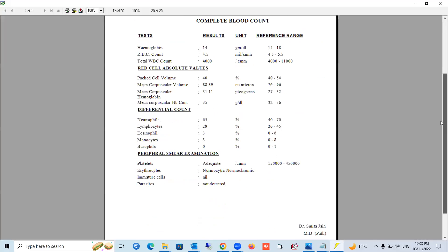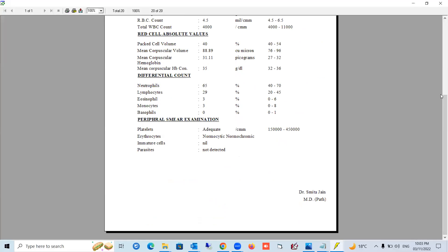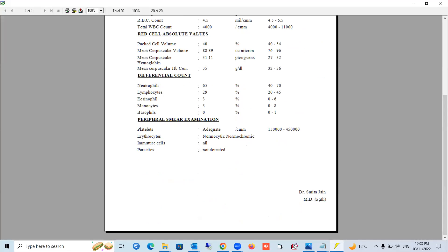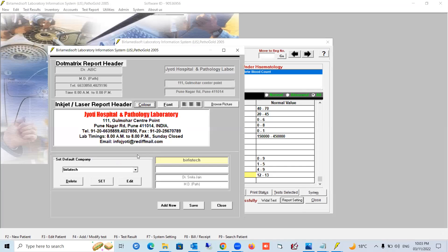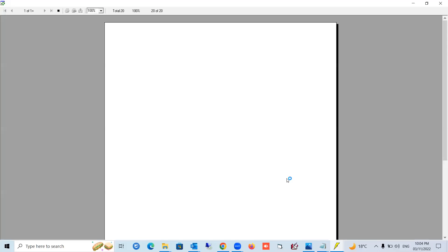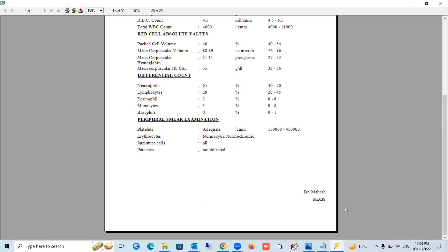Here is the completed report with all values and the doctor's name. If you want to change the doctor or lab name, press the 'Report Settings' button. Here you'll see the lab name and doctor name. Press Edit — you can change your company name, lab name, and doctor name. For example, type 'Dr. Mahesh' and add qualifications like MBBS. Press Save — the record is updated. Close and preview the report again, and you'll see the updated name 'Dr. Mahesh'.